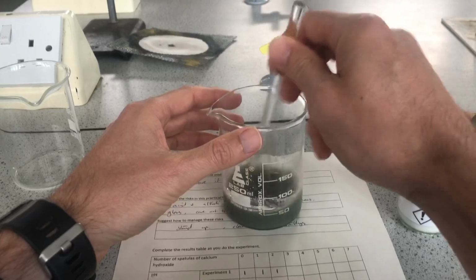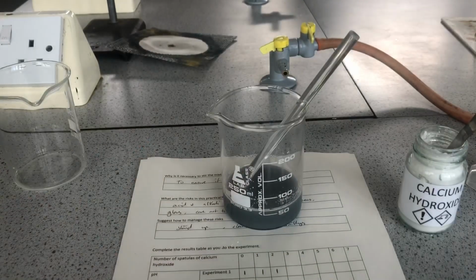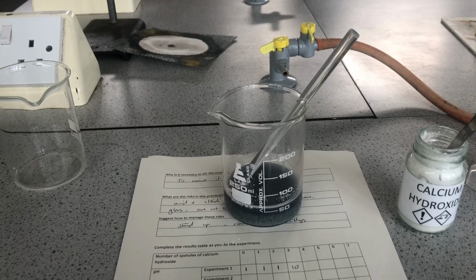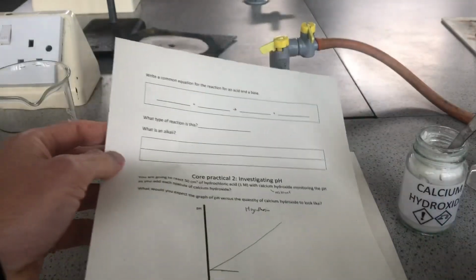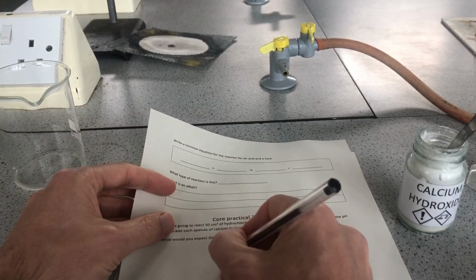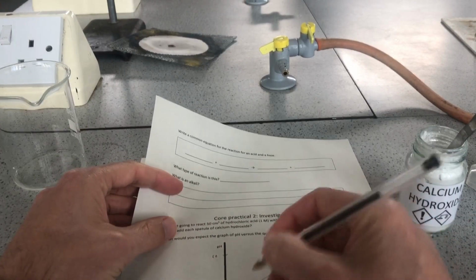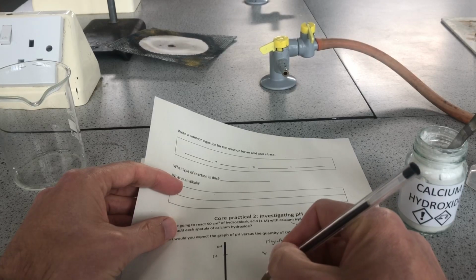Oh, we've suddenly got a change. So with our third spatula, we've suddenly changed. We've gone through all the colours of orange, yellow, green, light blue, and we've gone to a sort of blue pH there, which is now a pH of 10. So we've gone up to 10. So suddenly, if we were to look at our graph now, 10 might be up here. Okay, and we've suddenly, on our third spatula, gone all the way up to there, so it goes like this.